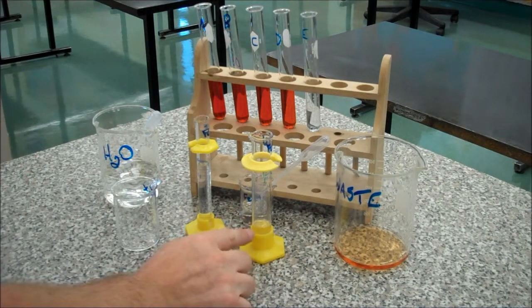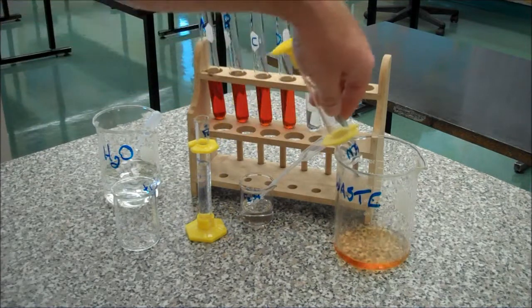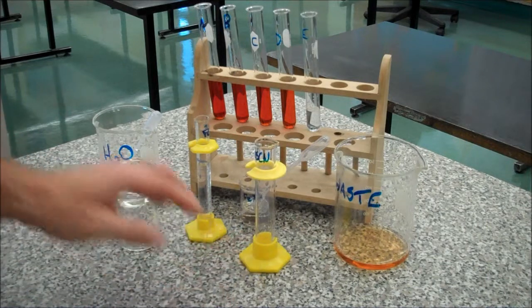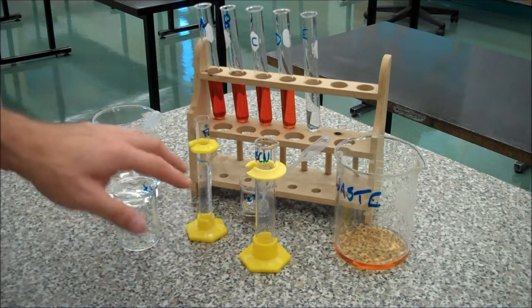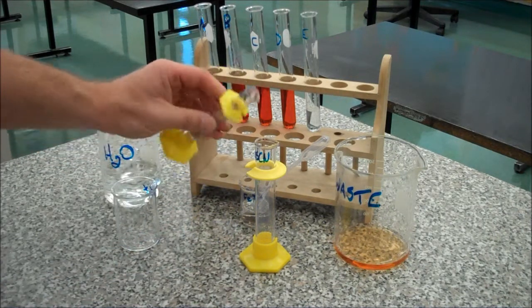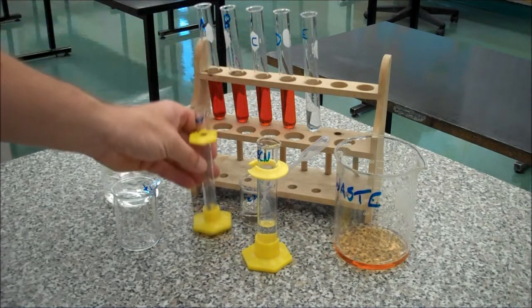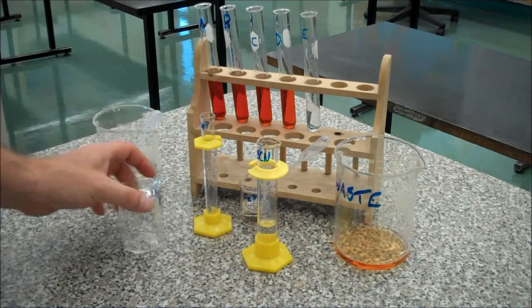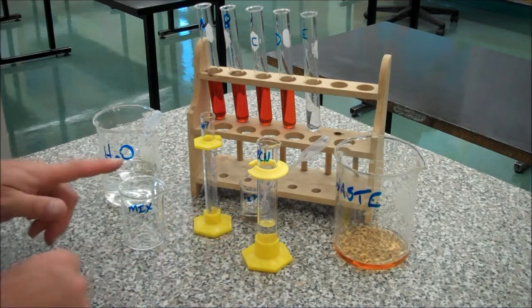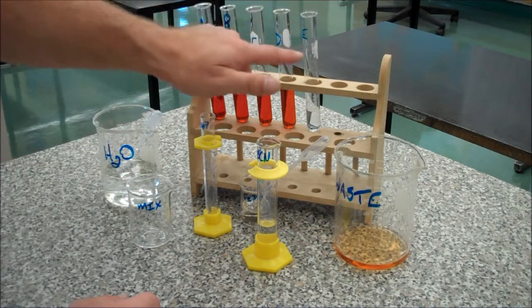This is going to be 10ml, straight up to the top of the graduations. Got a little too much, so I'm going to use my dilution. Okay, so this is my 10ml that I'll use for my final successive dilution. This now is waste, so I'm going to dump this into the waste container. I'll just transfer this 10ml in here, then add my water to get my 25ml, do my mix, take my 5ml, equilibrating, and add it to test tube E.